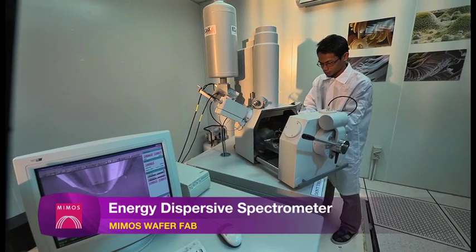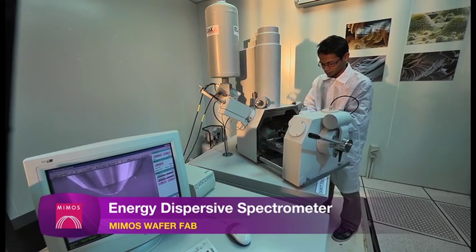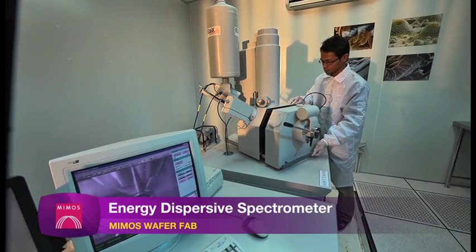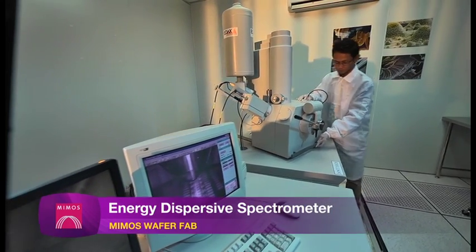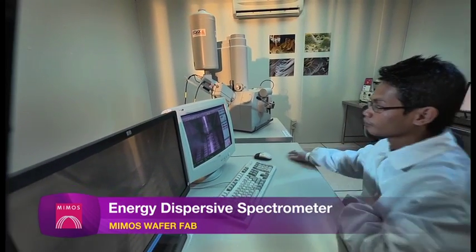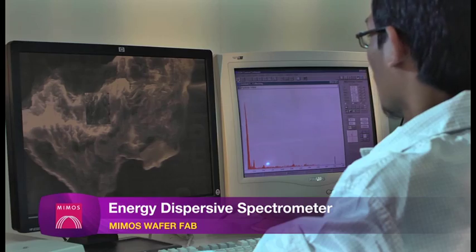Energy dispersive spectrometer is an analytical technique used for the elemental analysis or chemical characterization of a sample. It is a technique for identifying and quantifying elemental composition of a sample with an area as small as a few cubic micrometers.